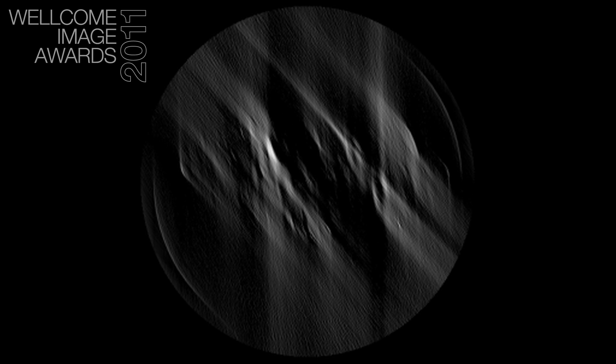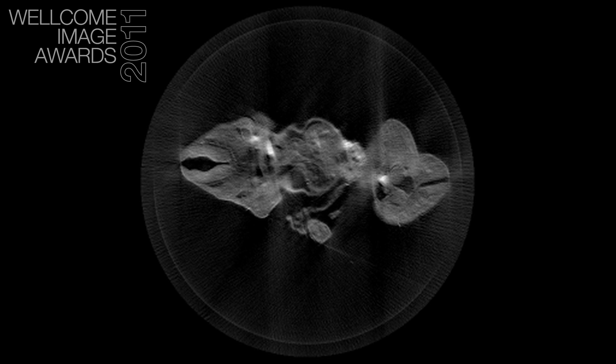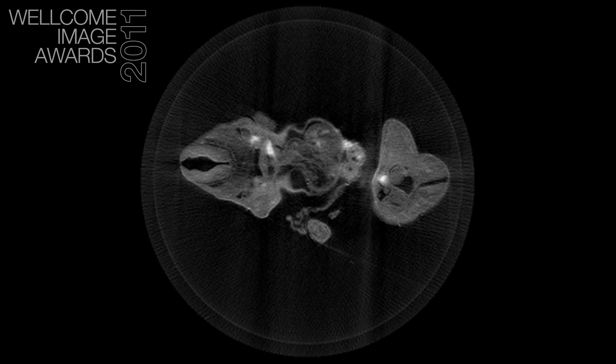Instead of focusing on a particular plane we actually focus all the way from the front to the back of the specimen. The 400 images, which is what we typically take, each one of them has lost the depth information and we only gain that back when we computationally integrate the images with each other.